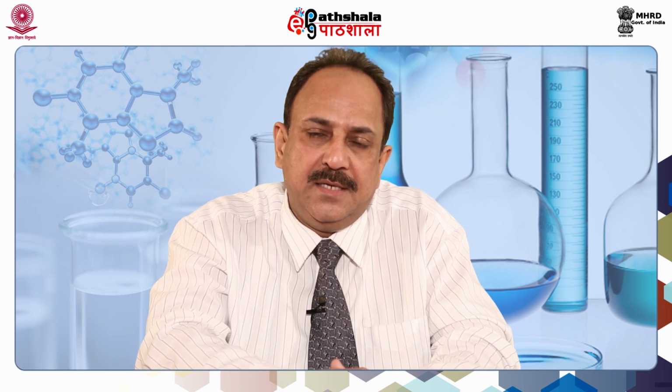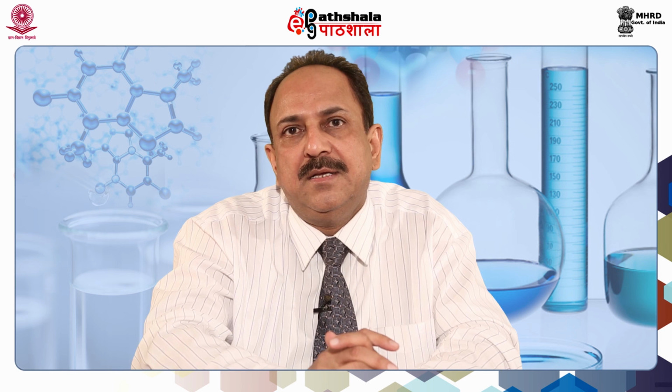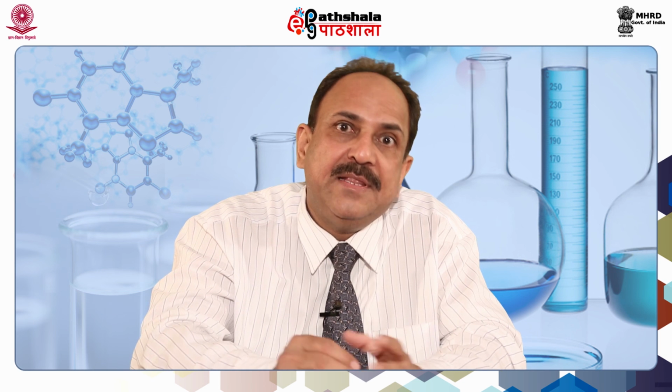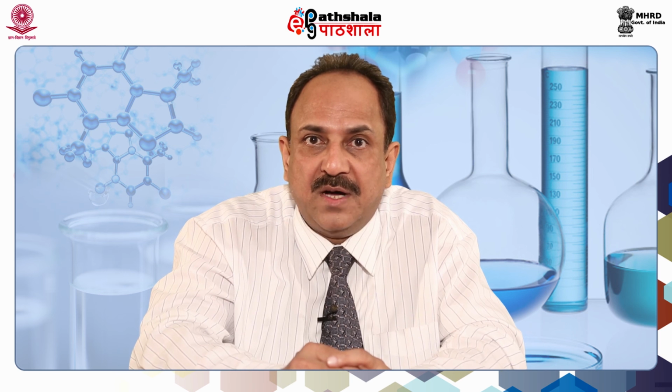Therefore, with this power now, having SwissPDBViewer in your hand, try analyzing other enzymes and try to understand what may be the mechanism by which this enzyme in your hand actually works.